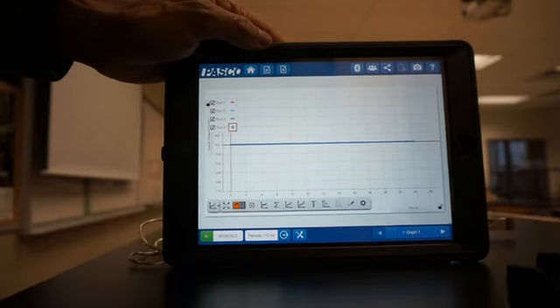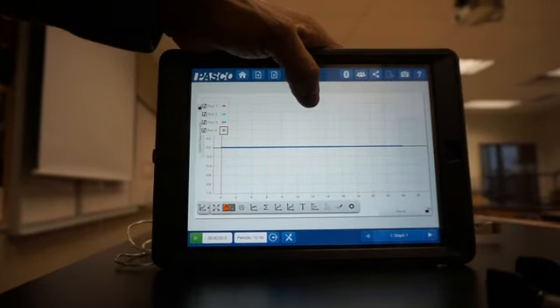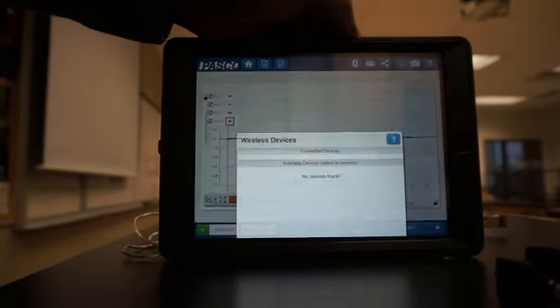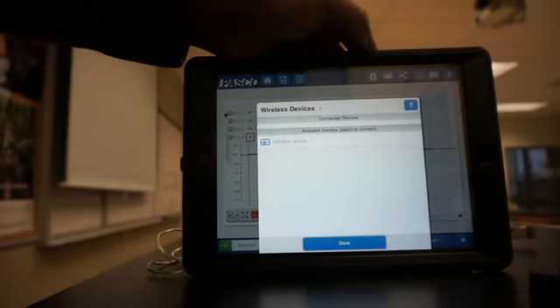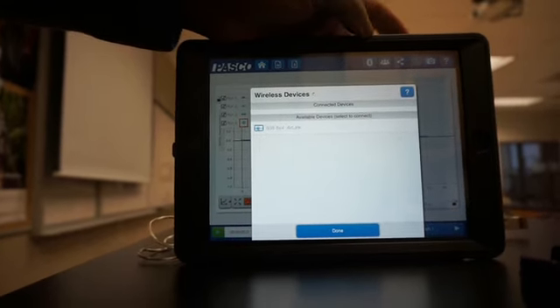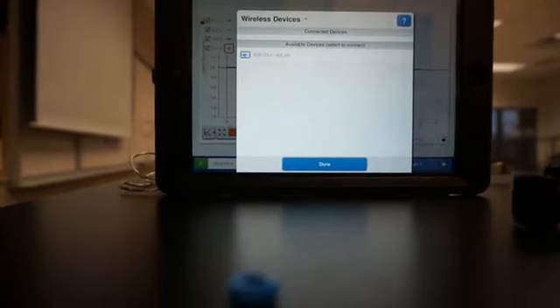In order to connect the iPad to the sensor, I click on this little Bluetooth symbol. When you're doing it, there are likely to be a lot of Bluetooth devices around, so you need to make sure you select the right one. Notice how it says 838844.